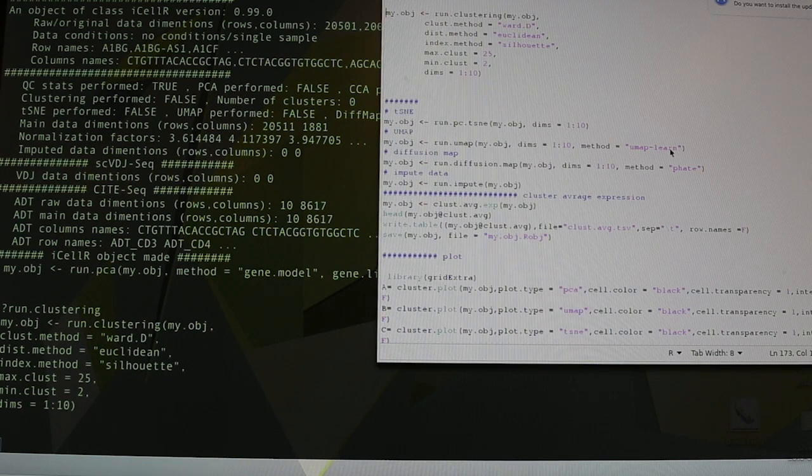You could do it the other way too, but this seems to work better. If you count all the values for one antibody across all the cells and get the sum that way, it seems to work better.